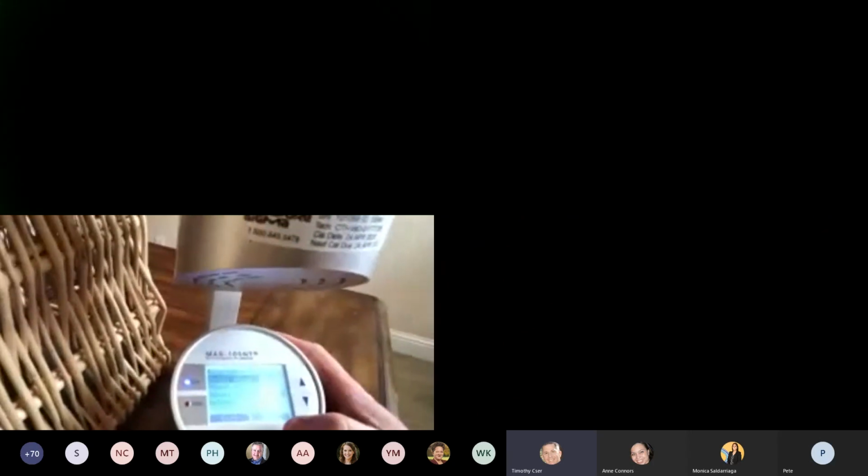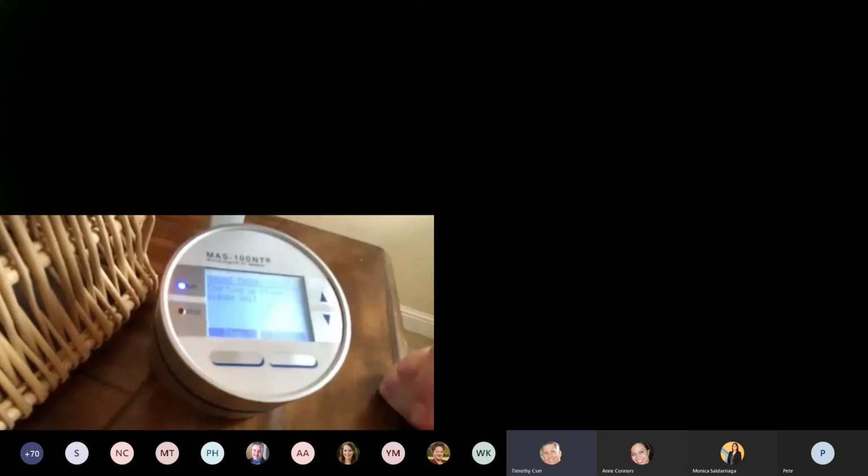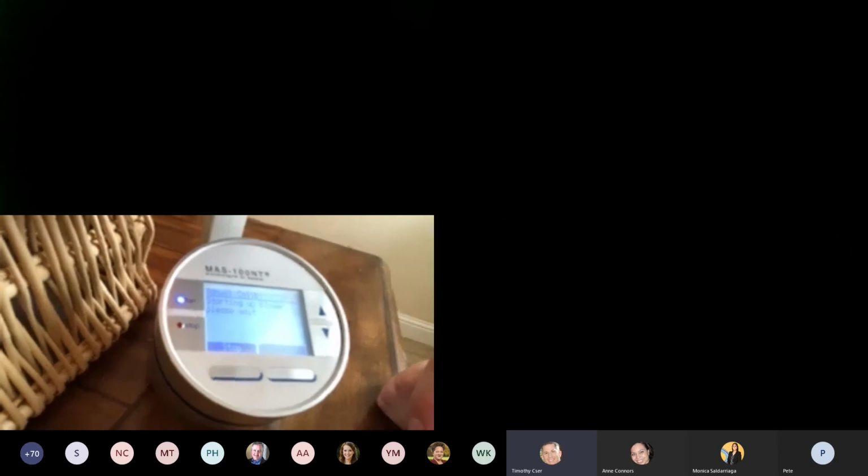The same thing, you average the numbers and you put the number that you averaged in. And now you'll notice it says sensor successfully adjusted. And that's that adjustment that we talked about. So I hit exit. At this point, you need to go into the calibration. Now I say select and it starts the motor running again. And we're just going to wait a second here.